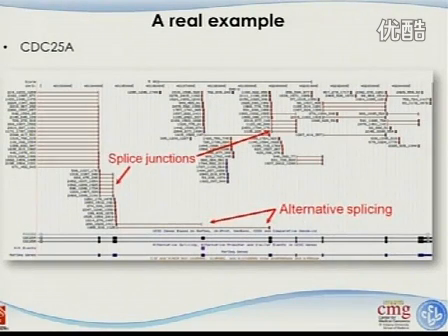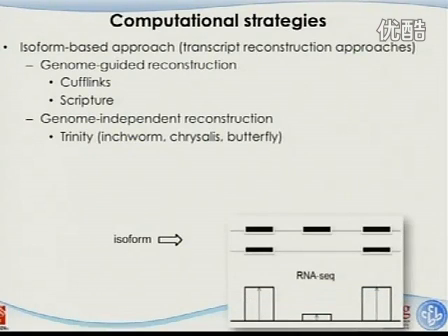And we have seen this example before. So this is a real life example. There are so many exons here, and then there are introns. And this particular read is supporting that this exon will be included, and this read supporting this exon will be included, and this read supporting that this exon will be excluded because these two exons join together. And this will tell us that there are multiple isoforms in this particular gene in the sample. Okay? So now let's go to the analysis part.